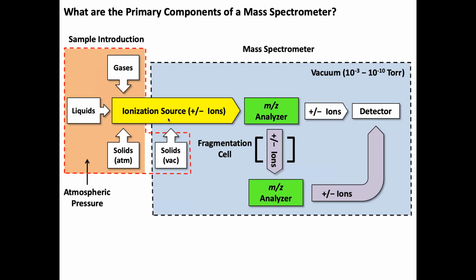So we now have a huge array, well, not a huge array, it's getting smaller and smaller, but the mass analyzer technology that we have is just profound in terms of its power. I'll talk about MS or MS/MS or MS to the n.